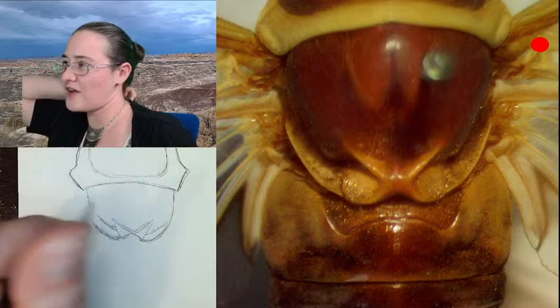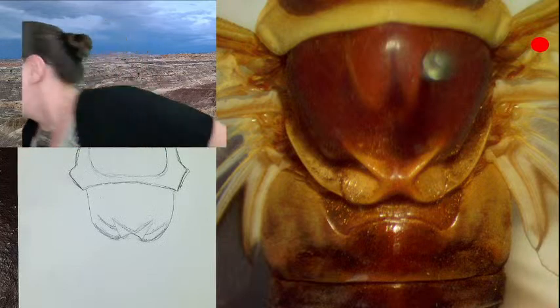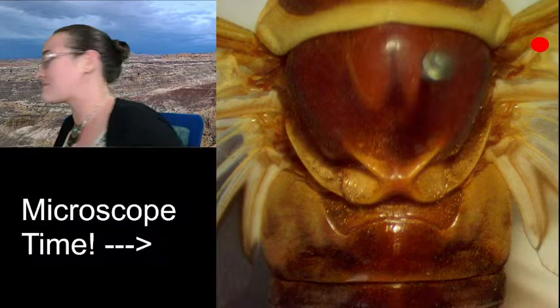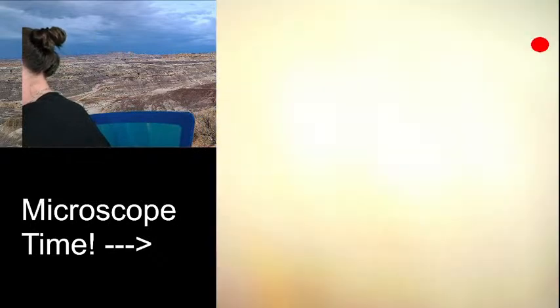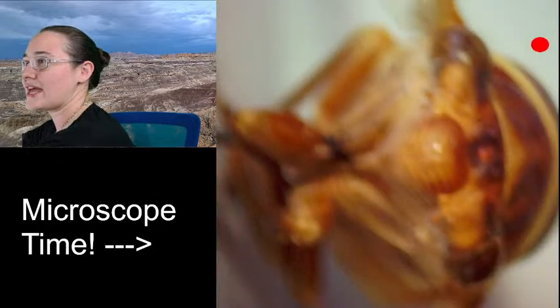That's really cool. Do cicadas have antennae? Yes, cicadas do have antennae. I was looking at this specimen's antenna just a little bit before the session, because with this cicada's antenna, you can't really see it from the dorsal view. So you have to put it on its side and give it more light.